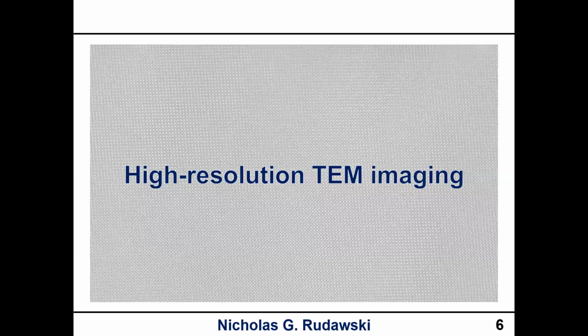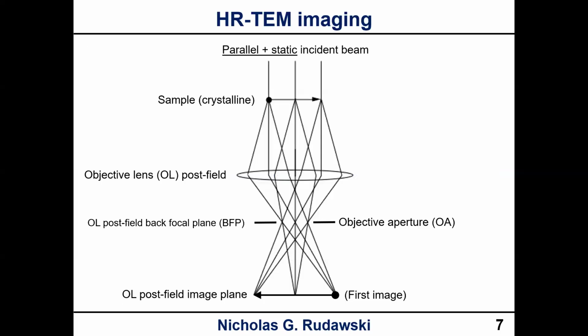All right, so the first one is high-resolution TEM imaging. And in my opinion, this one is the most important one. Your ability to not only perform high-resolution TEM imaging, but also to fundamentally understand it and how it works, really provides the basis and the background for all other types of imaging in the STEM, specifically high-res.